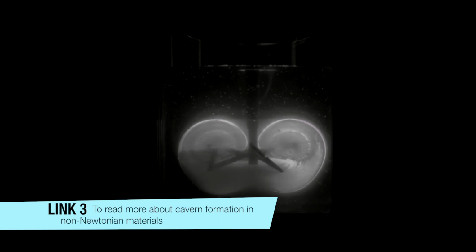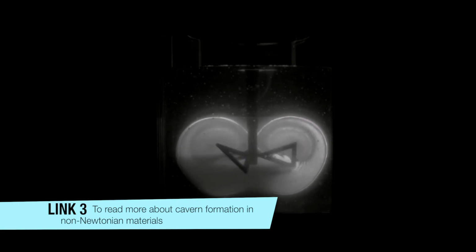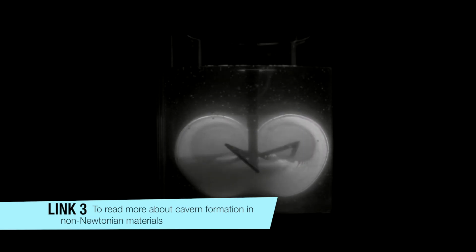And this is really useful to see cavern formation in non-Newtonian fluids over time, which is something that is undesirable in a lot of process equipment.